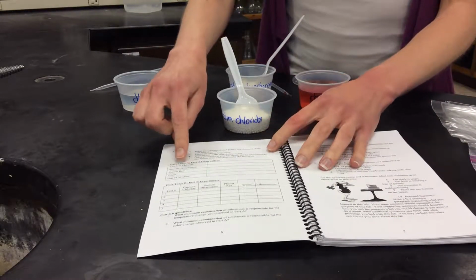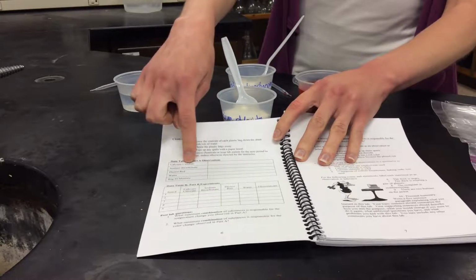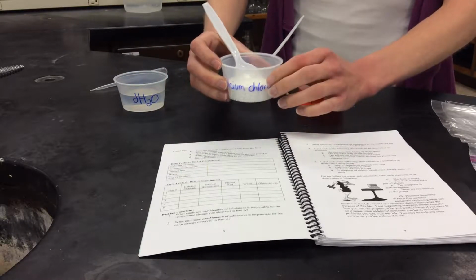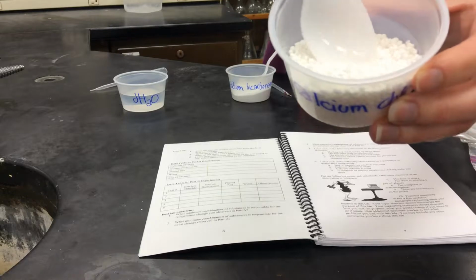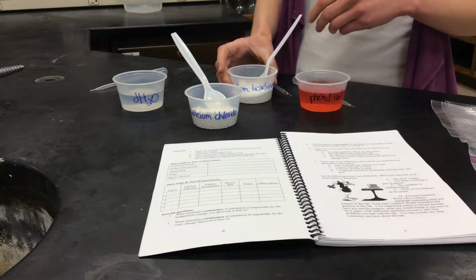All you need to do is write down some observations about the following 4 chemicals. Okay, so calcium chloride is the first chemical you're going to observe. Just write down what it looks like. You can see right here. Okay, write some observations down.